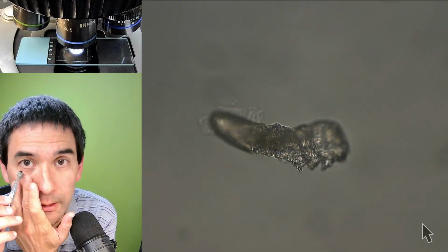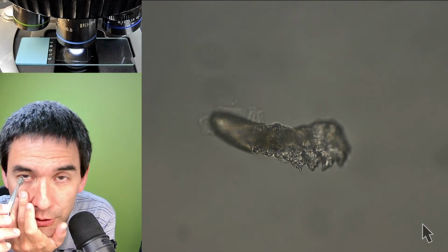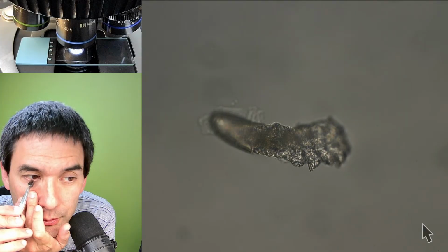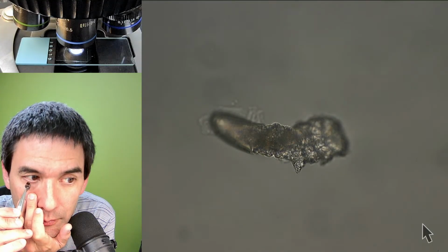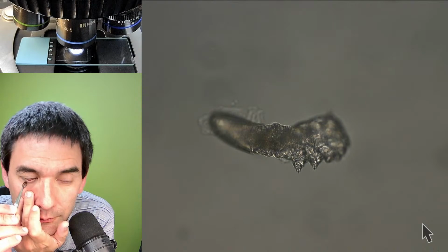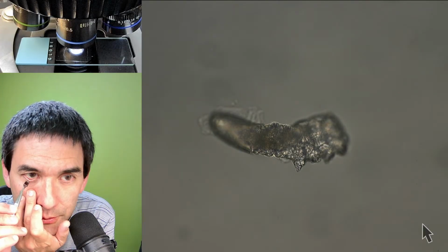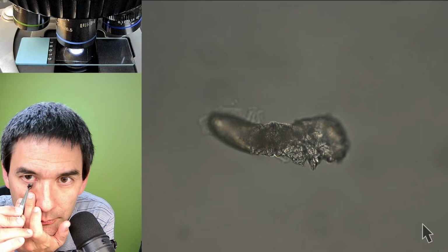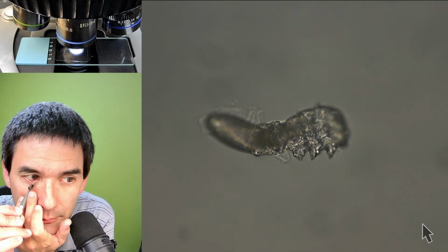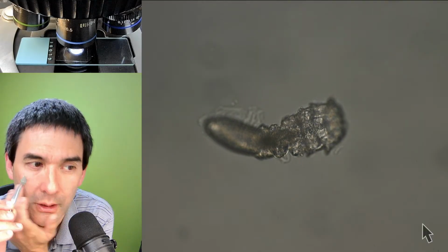Let's have another try. So I'm going to just grab some of the eyelashes. You can maybe also try the top ones, but the bottom ones are a little bit easier to reach. Can I grab them or not? Here we go. You carefully rotate. If there are any present, they're going to be squeezed out this way. Okay, maybe that's going to be enough.